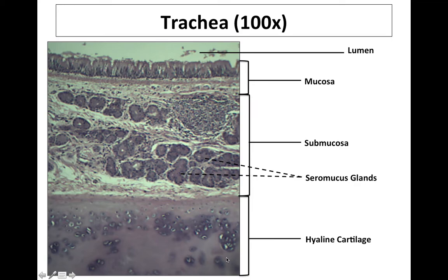Hyaline cartilage in itself is a very glassy looking tissue, but it stains pink when you're looking at certain types of slides. And the most notable characteristic of the hyaline cartilage is a series of holes here. They look like eyeballs, right? This is a cell type called a chondrocyte inside of a little pocket called a lacuna. And so this is pretty typical of the three types of cartilage within your body, hyaline cartilage being the kind that you see here. It's predominantly made of collagen fibers here in the matrix, and so that's what gives off this nice pink appearance in this slide.